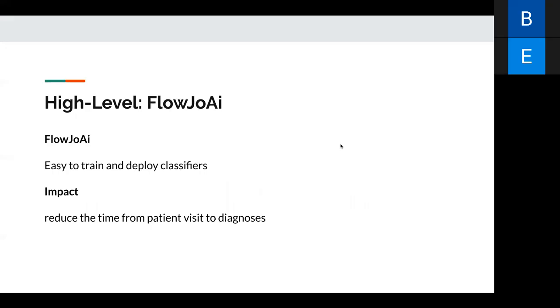So this is where FlowJo AI comes in. FlowJo AI makes it easy to train and deploy classifiers, and overall will reduce the time from patient visit to diagnosis, potentially saving a life.